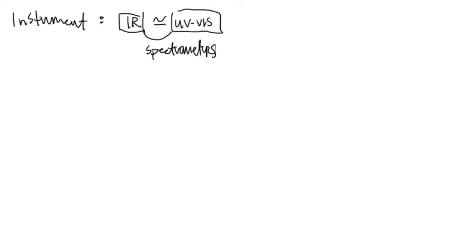All right, so in our schematic of the infrared, in the very beginning, just like with the UV-vis, we have a light source. And we need to talk about what that light source is, because I guarantee you it's not deuterium and tungsten, because that was used for UV.